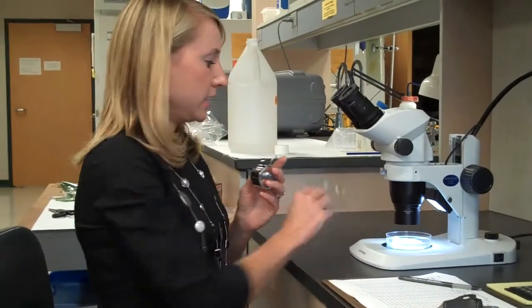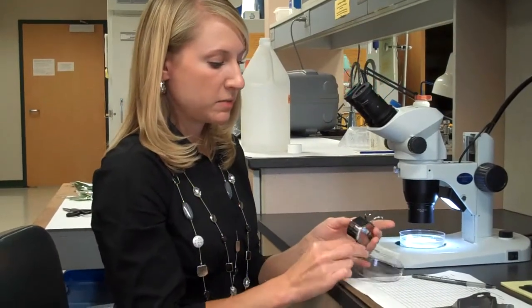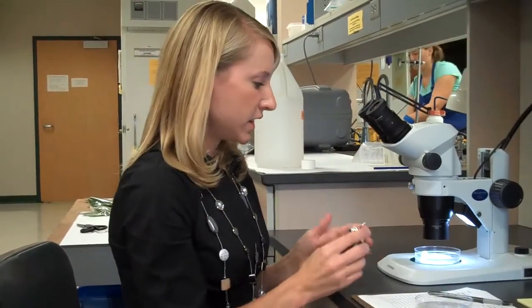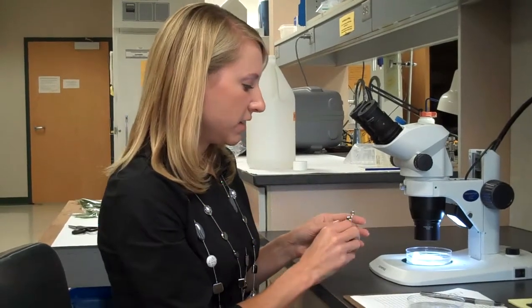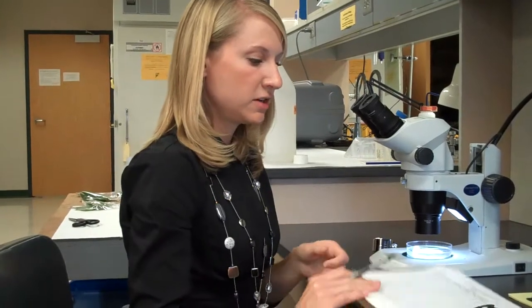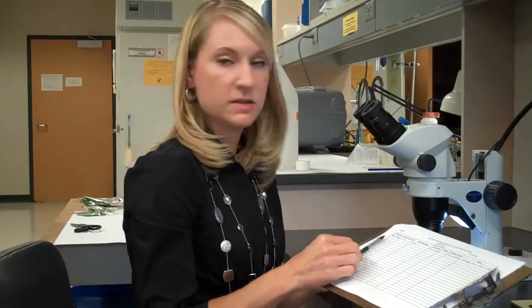One technique I like for quantification is a gridded petri dish that lets me keep count and move the dish along the tracks. Inexpensive counters help you track counts rather than keeping them in your head, since rust mite samples on leaves can range from several hundred to several thousand. And of course, having a data sheet available that allows you to list the sample is important.